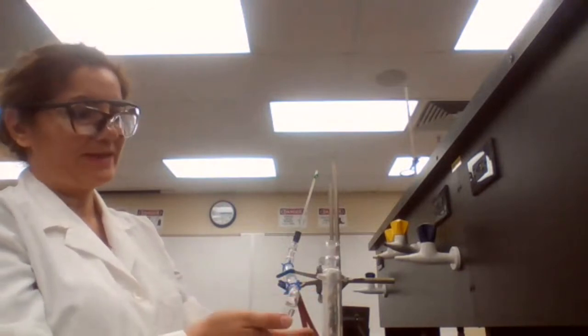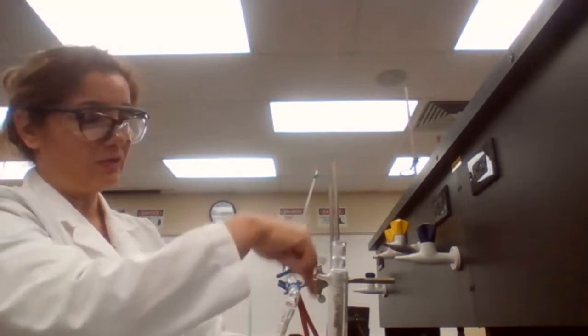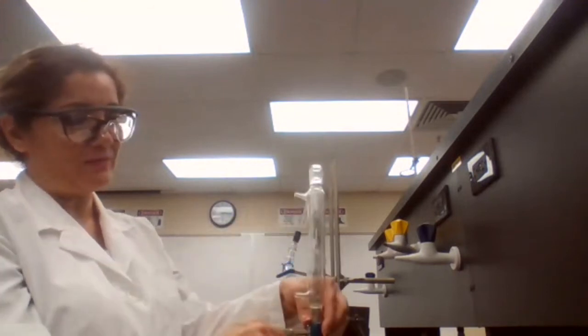Every time vapor of B is trying to come up, the temperature of the column is going to reach first the boiling point of vapor A. So it's hot enough for vapor of A to survive, but not hot enough for vapor of B to survive. It's too cold for vapor of B to survive. So vapor of B is going to condense back and go back into the flask.